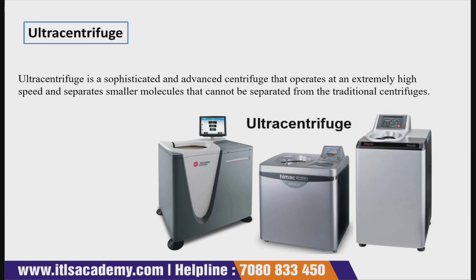Now let's see the definition. An ultracentrifuge is a sophisticated and advanced centrifuge that operates at an extremely high speed and separates smaller molecules that cannot be separated by a traditional centrifuge. So this is a sophisticated machine, or you can say device, with a very advanced centrifuge application, and it operates at an extremely high speed, and it generally separates small molecules that cannot be separated by the traditional centrifuge.